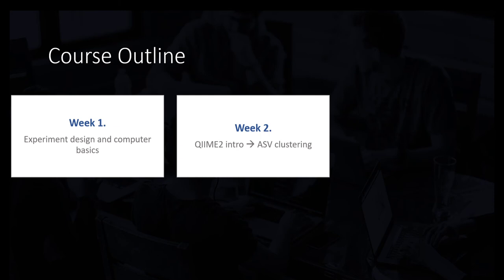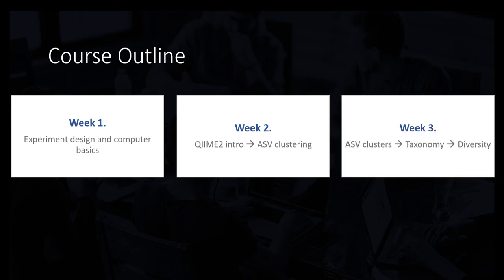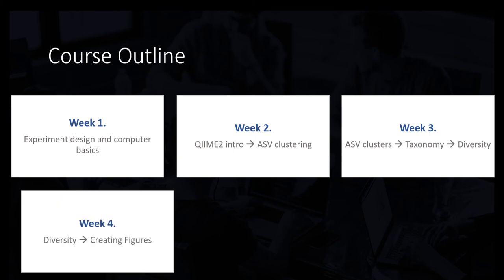We'll do a little bit of an intro there, and work on some clustering using some new ASV techniques. Then we'll go all the way to determining taxonomy and diversity from those clusters in week three. In week four, we're going to actually create diversity figures and different things in R. So that's good for those people who like to make figures in R.